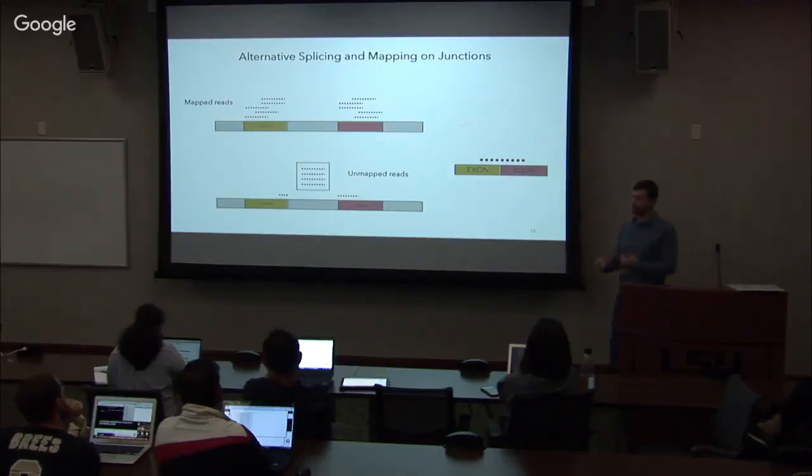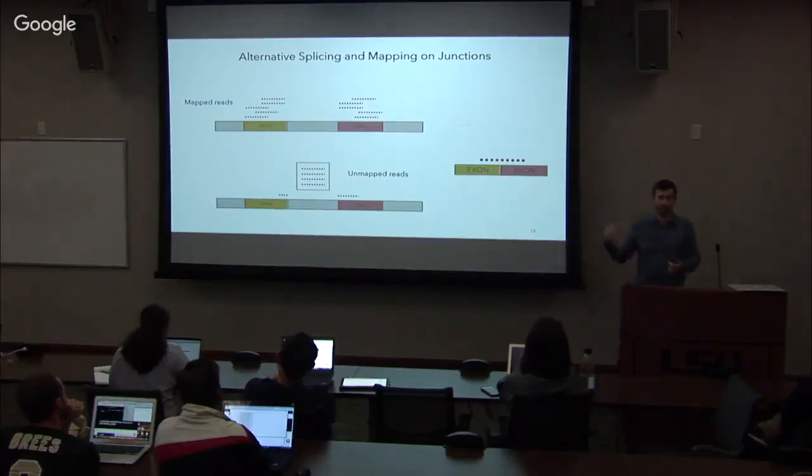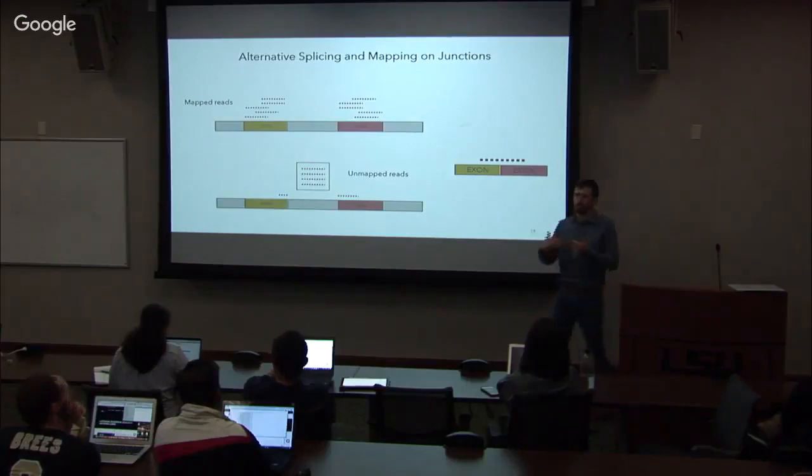And when we look at the pipeline, we will see how the steps that we take on the pipeline actually represent this kind of process where we map some reads, then we identify exons, then we look at junctions between exons, make isoforms, and then we quantify.